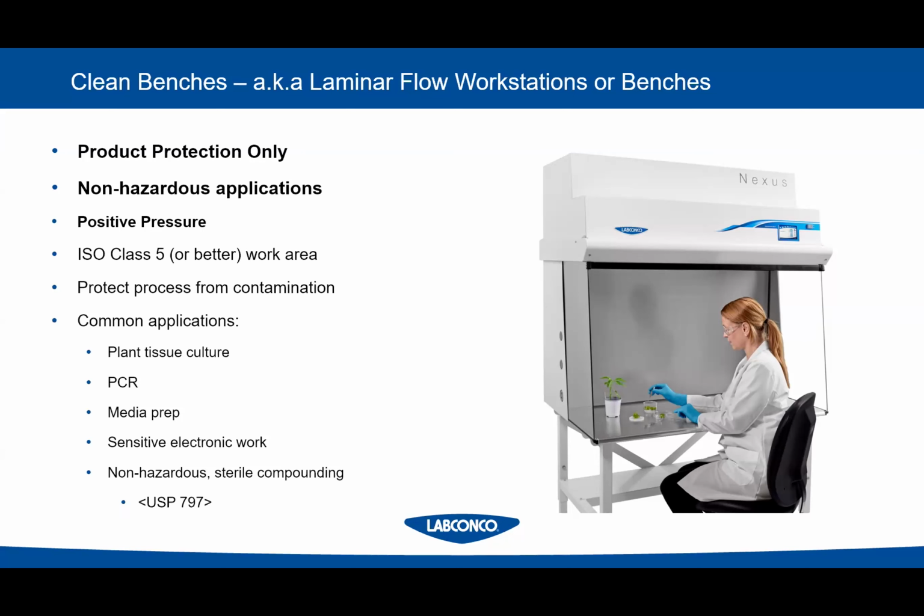Common applications: plant work. I'm sure you guys have these on campus in some plant labs somewhere, as well as PCR enclosures, if you've heard of that application. A lot of media prep can be done because cell culture media, things like that, aren't hazardous. You might not want your biosafety cabinet time being taken up by something that just needs a clean bench, so it can save time on other hoods. They're also used in some electronics labs just to keep dust and things away from the sensitive components while they're packaging them up. And then in non-hazardous sterile compounding. So if you have a vet compounding pharmacy, you'll find these in that lab as well.